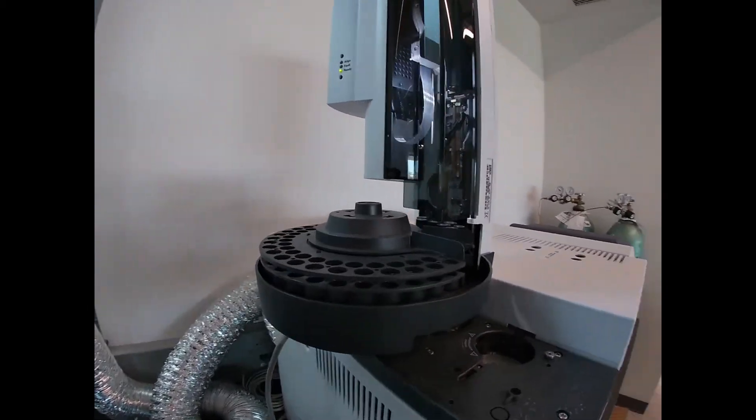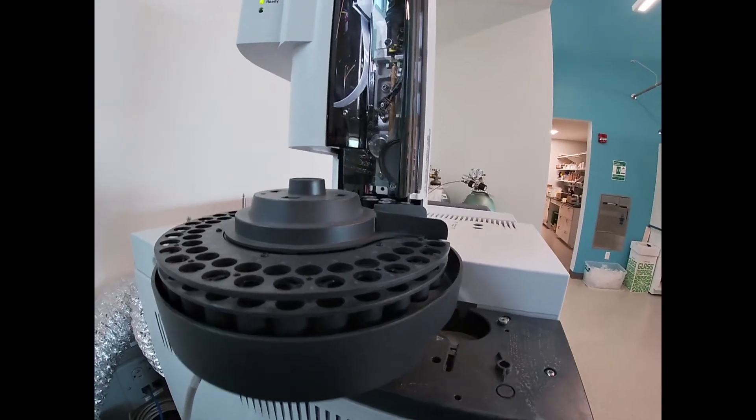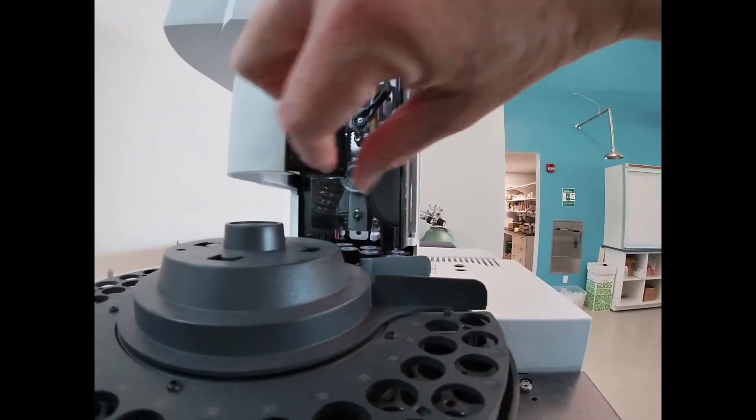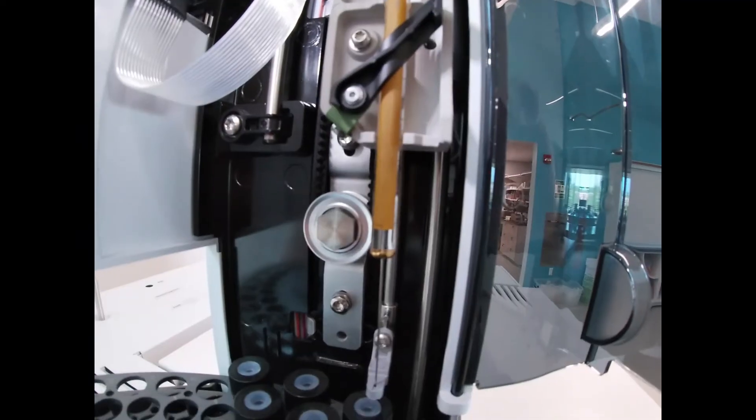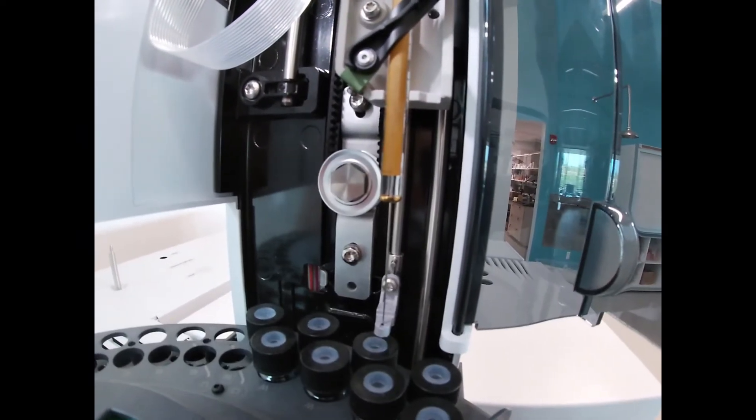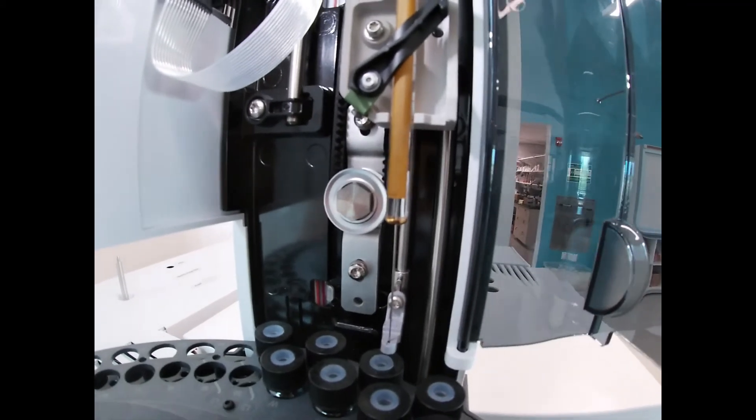Ours is fitted with an autosampler, auto-injector. So we have our needle for our auto-injector right there, so we can inject typically microliter amounts at a time.